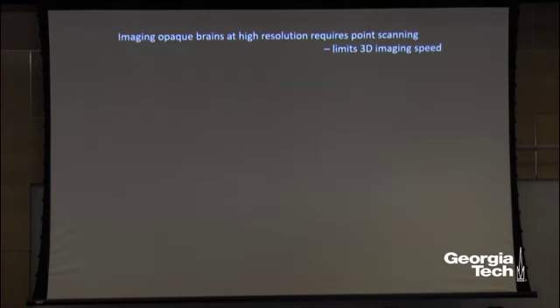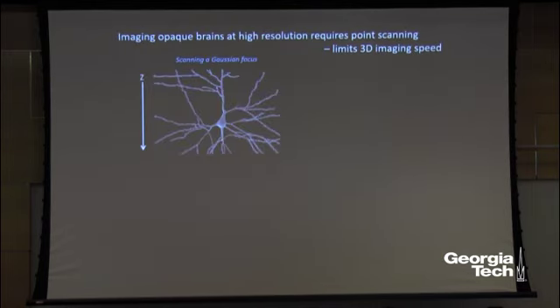Why is that? The challenge is because with the 2-photon, remember I was telling you the way we form an image is by scanning this focus. I don't know whether you can see. Hopefully you can see a little bit. You can see the focus is scanning, right?